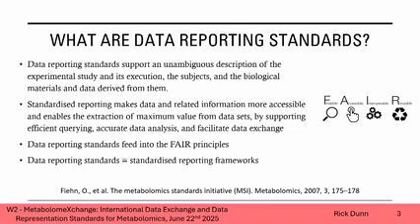So what are data reporting standards? I gave a brief summary, but really these are a description, okay, of the experimental study and of the data that's been collected. So what the study is, how the data's been collected, what the data is. Okay, so it's got information about the subjects, the biological materials, the instrument that you've used, etc., all within there.